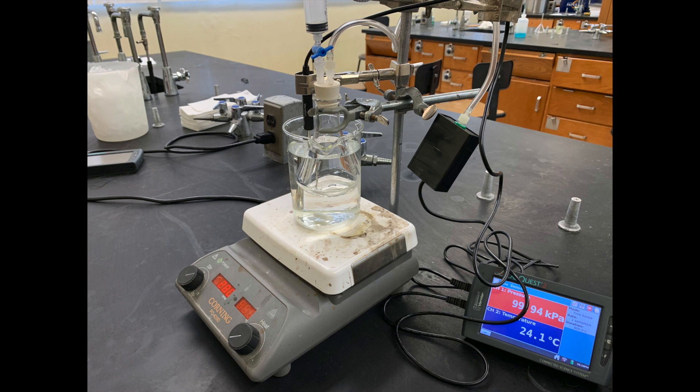The LabQuest 2 is connected to a black box pressure sensor that is attached through a clear plastic tube to an Erlenmeyer flask. The Erlenmeyer flask is in a water bath and it will hold the liquid methyl alcohol and its vapor. The LabQuest is also connected to a thermometer recording the temperature of the water bath. The water bath in the beaker is on a magnetic stirrer hot plate, which will warm up the water bath and the methyl alcohol in the flask.